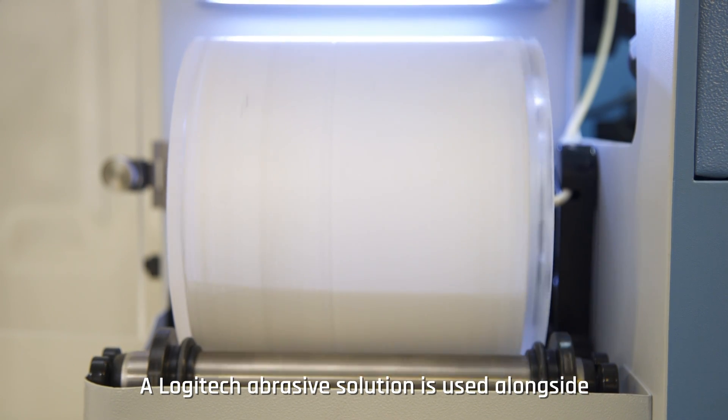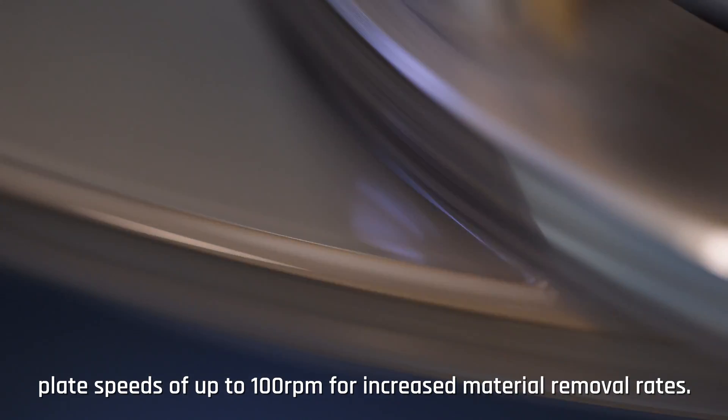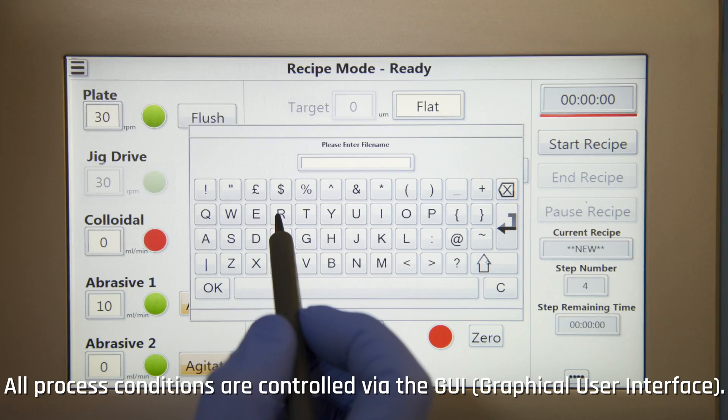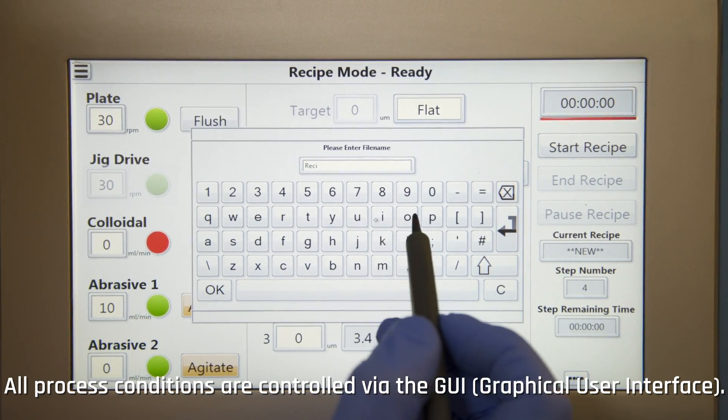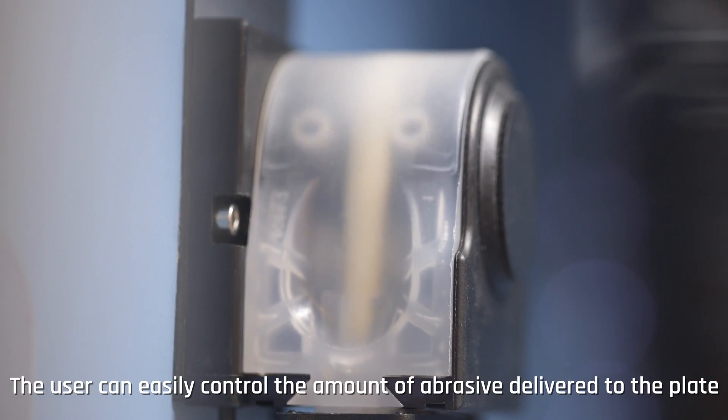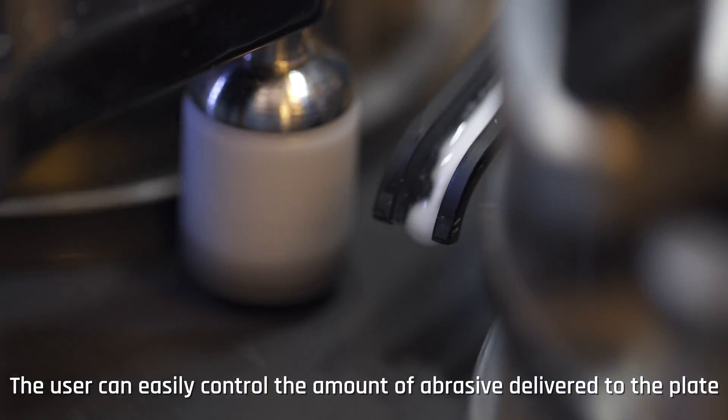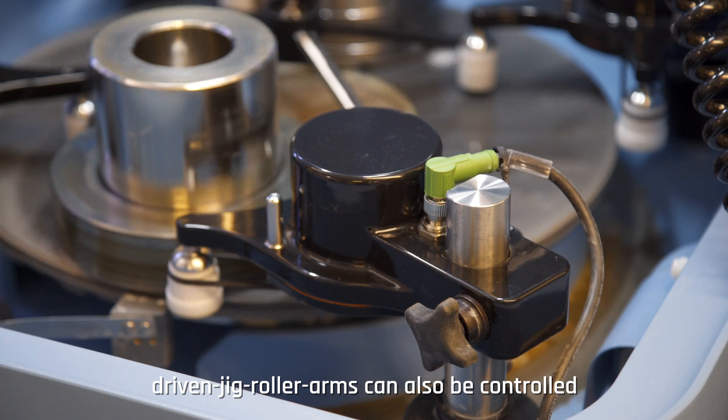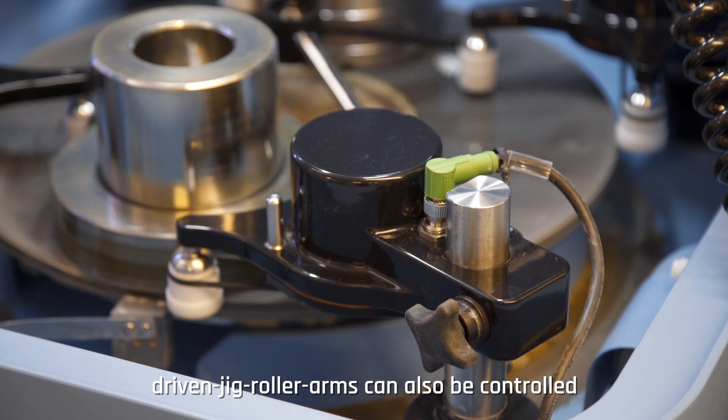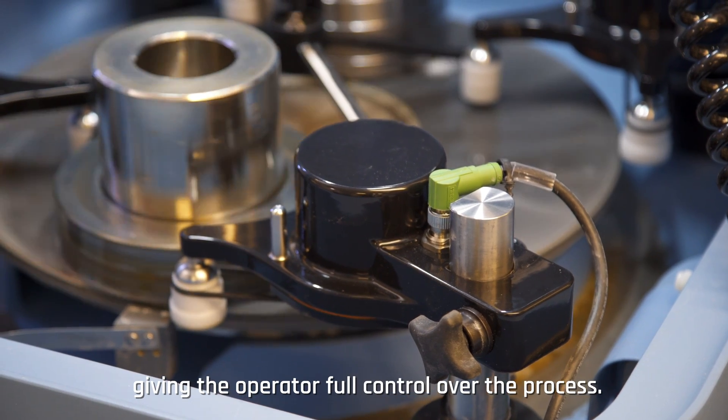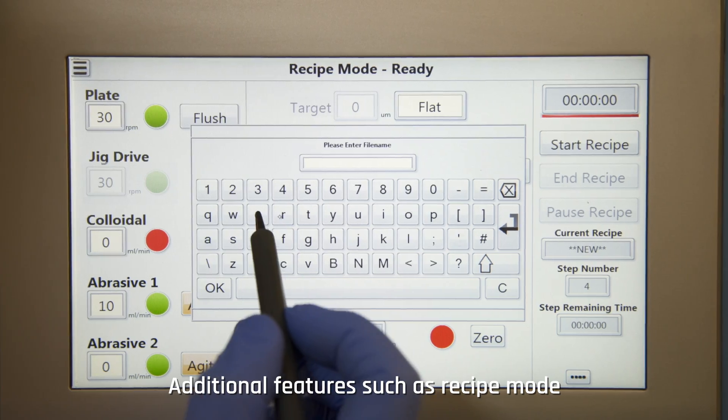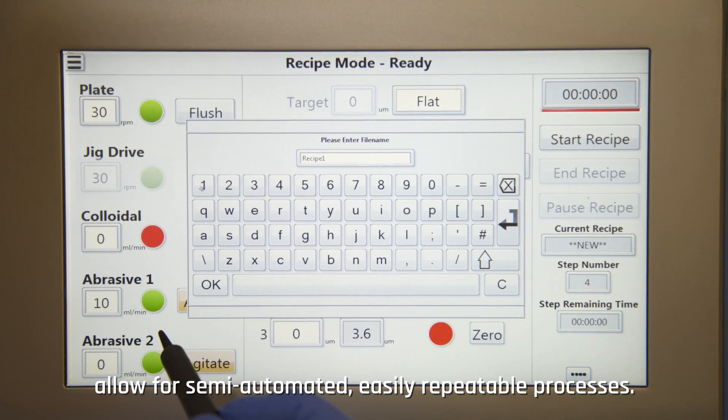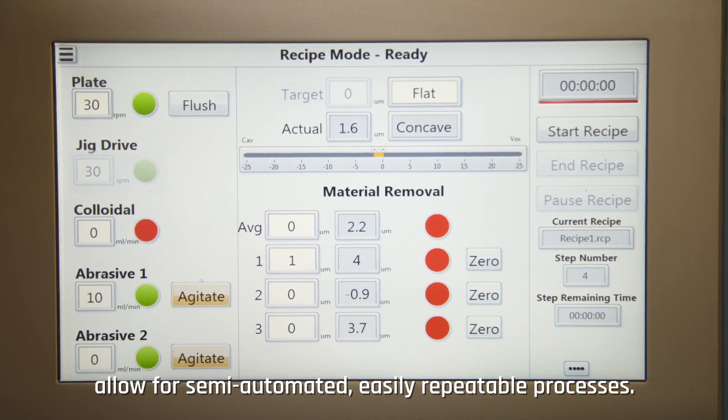A Logitech abrasive solution is used alongside plate speeds of up to 100 rpm for increased material removal rates. All process conditions are controlled via the GUI. The user can easily control the amount of abrasive delivered to the plate via the metered abrasive feed unit. Driven jig roller arms can also be controlled, giving the operator full control over the process. Additional features such as recipe mode and automatic plate flatness control allow for semi-automated, easily repeatable processes.